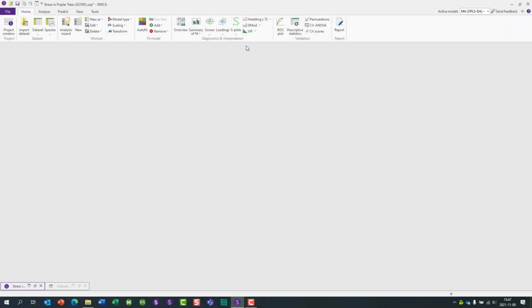Hello and welcome to this how-to video relating to the omics skin inside the SIMCA software. In this how-to video we are zooming in on the S-plots group. In general terms you can say that S-plots provide visualizations of OPLS and OPLS-DA models focusing on the loading of the predictive component, and the S-plots are there to simplify interpretation.